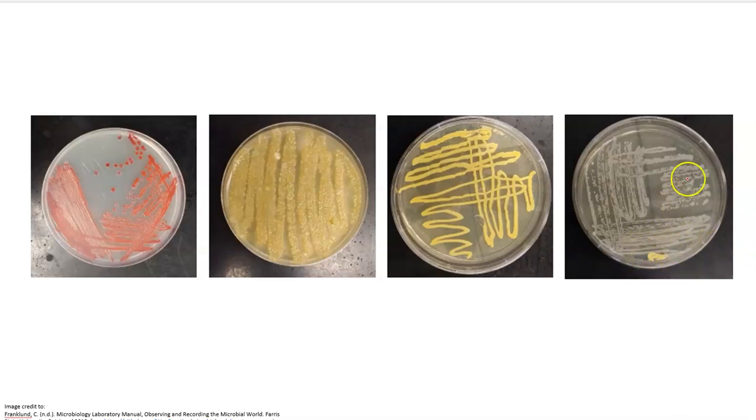This yellow growth is unlike this kind of white circular growth that we see here, so this is likely some contamination here, possibly from not using the lid as a shield, like maybe the lid was opened up all the way, or maybe there was some contaminants on the inoculating loop that was used.